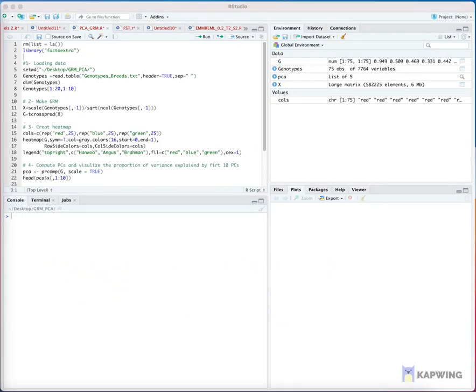Step 1: Load our packages. The only package we are going to use is FactoExtra.